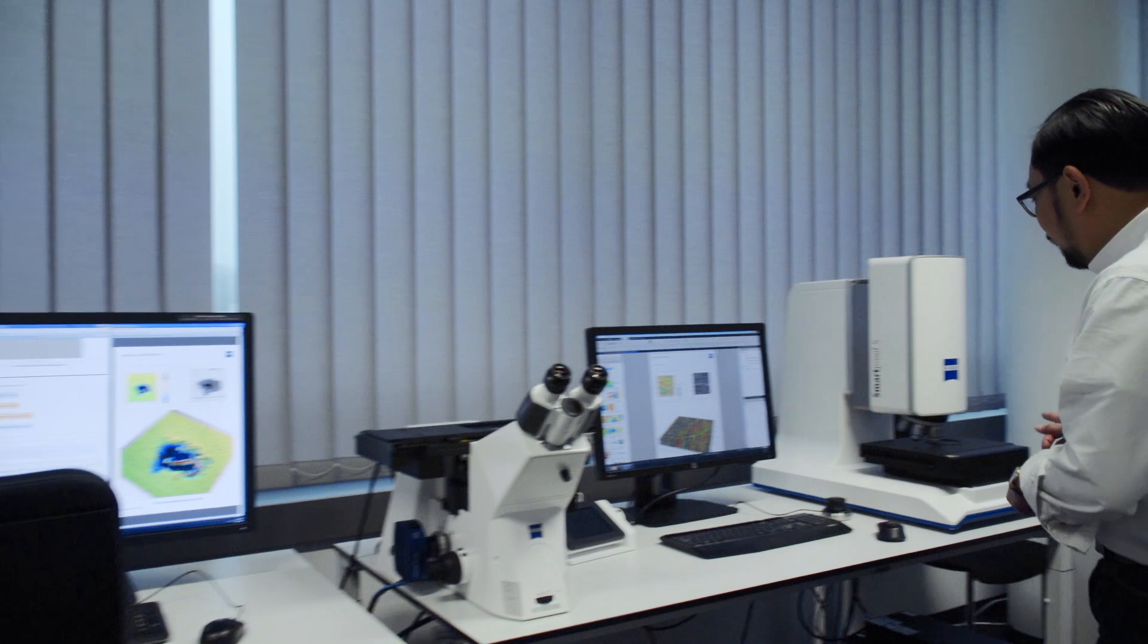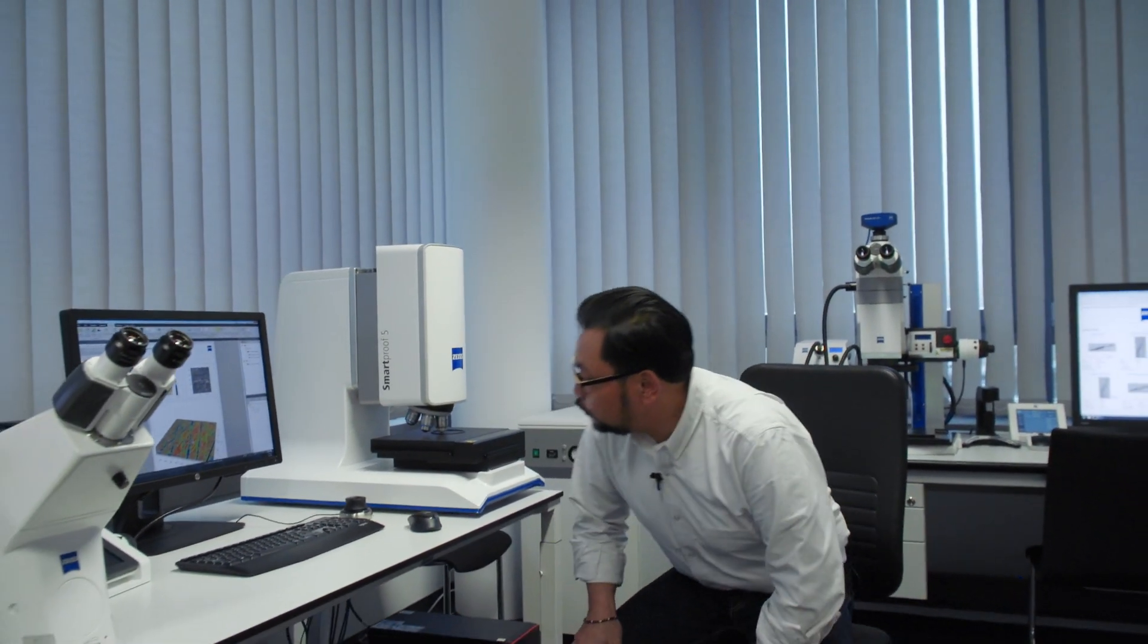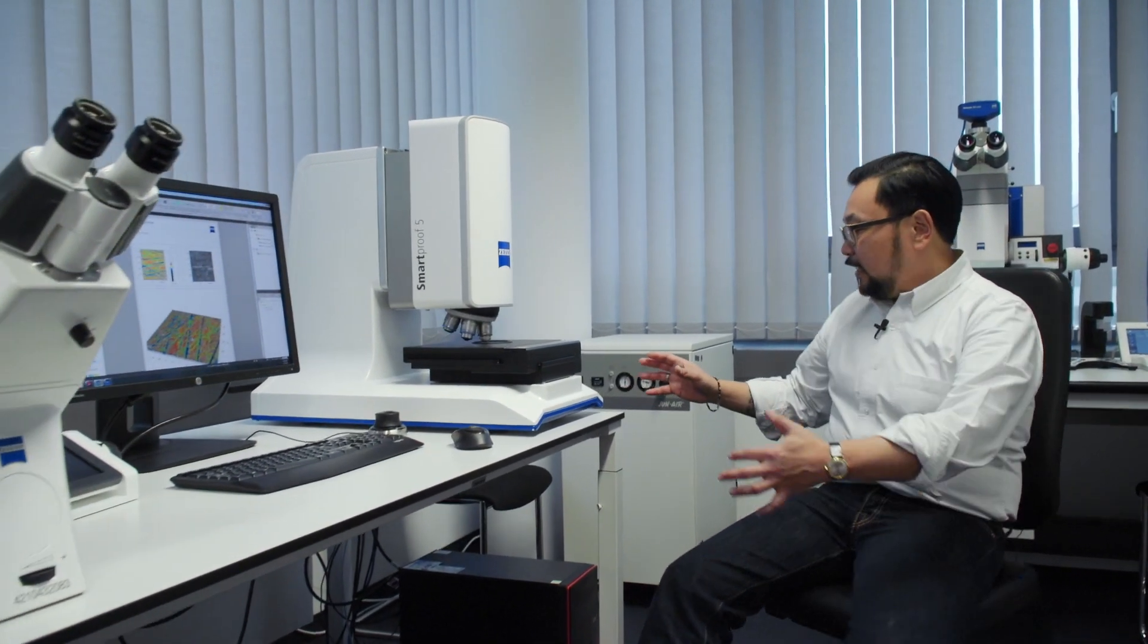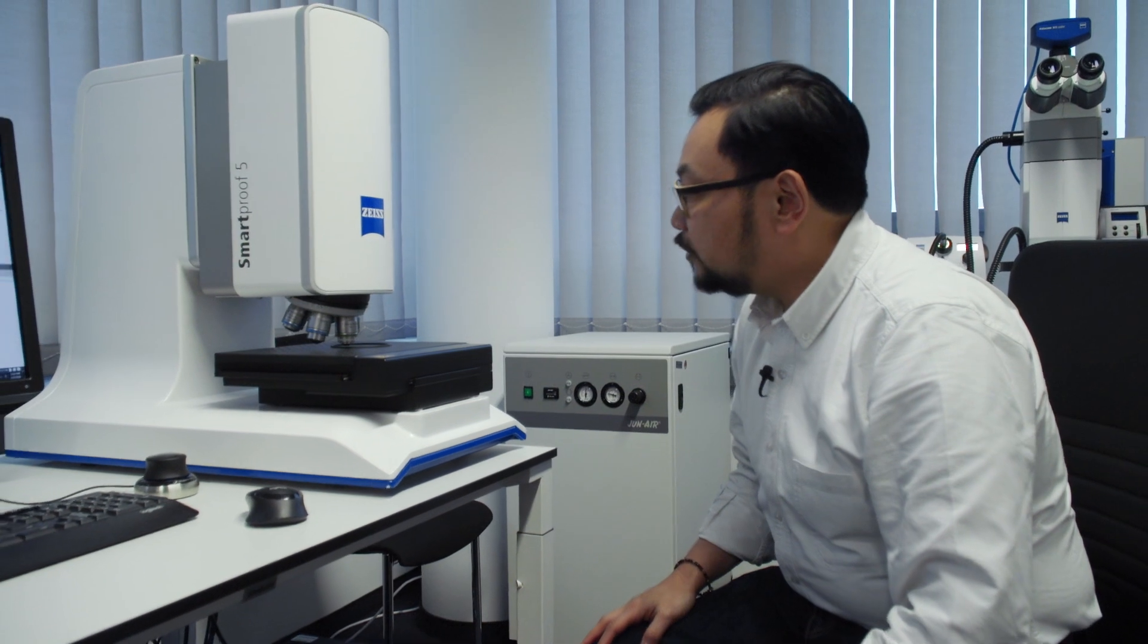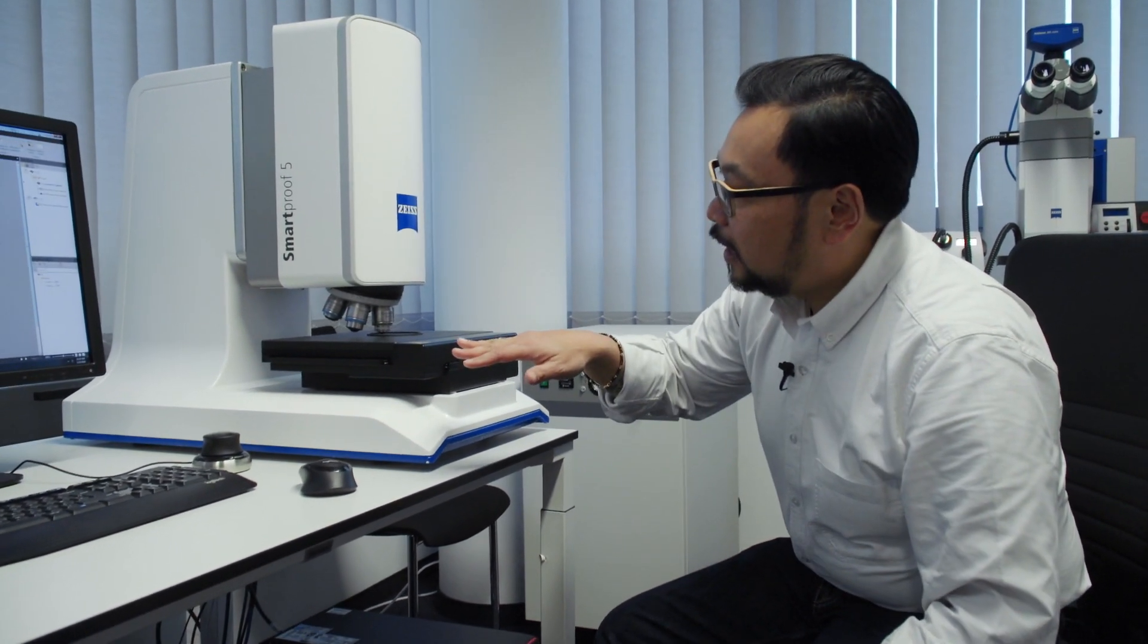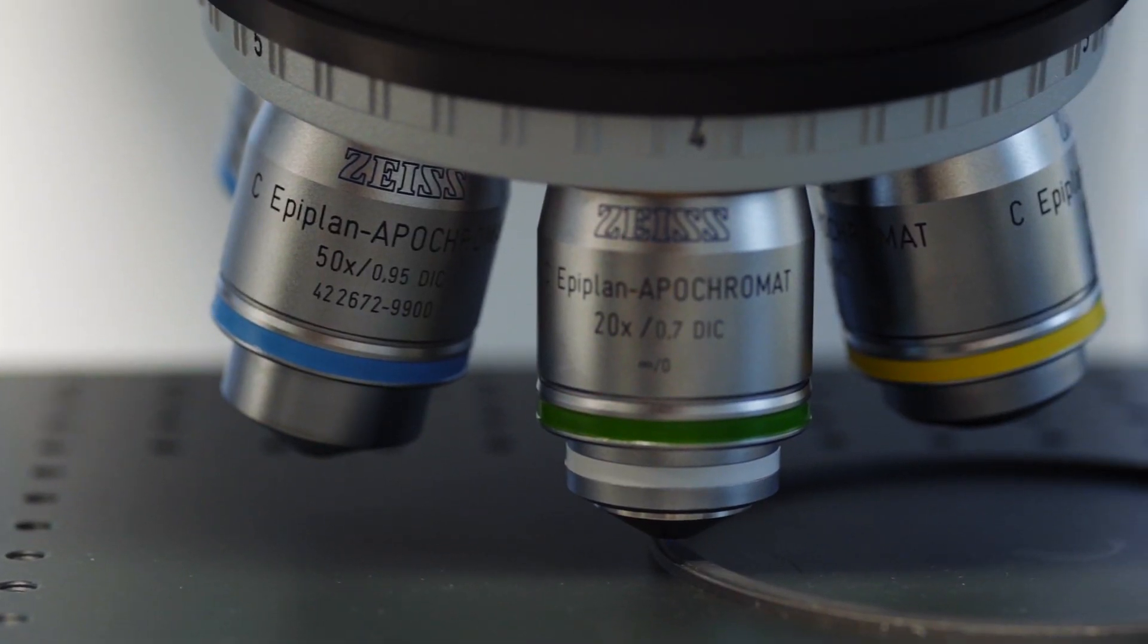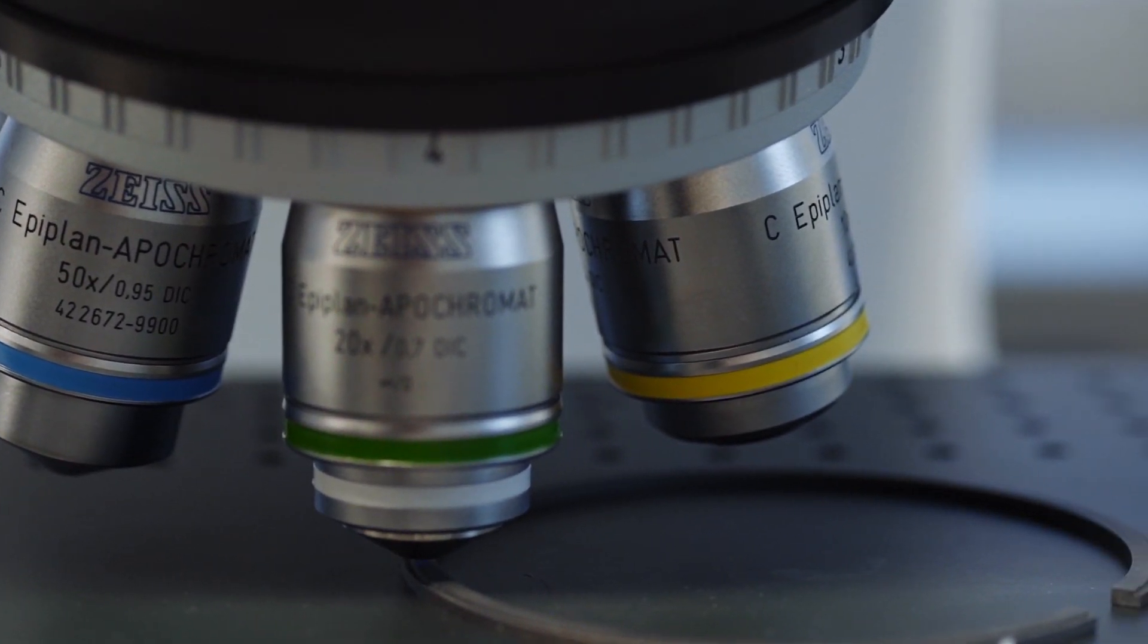But what we found over here was something we call the Smart Proof. The Smart Proof is a little different take on the confocal microscope. First and foremost you'll see that it's on a normal table because it's less susceptible to vibration which is something my customer wanted. Also what you'll see is we've replaced the laser light source with an LED light source which makes it a lot more robust and easier to replace and maintain.